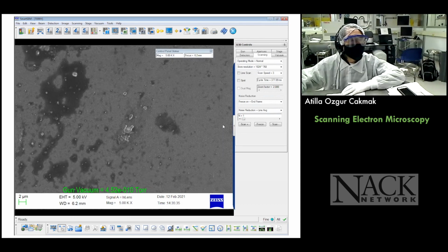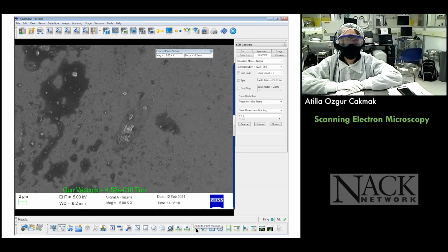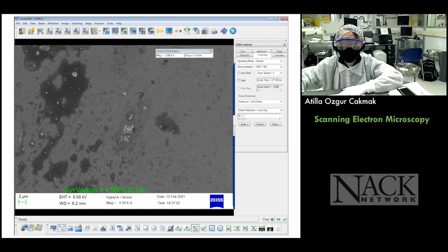So, Narendra, can you see my icon here again? I'm now sitting on the point-to-point measure icon. Do you see that? Left click on it, please, and then let's get a measurement on one of these objects here. You can measure to the endpoint. I think it's again about the mouse pad, unfortunately. Let me help you with that just to save a little bit of time.